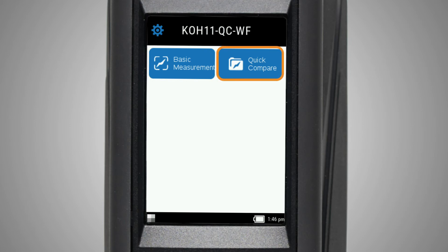To the right is quick compare. This mode is used to create standards or select standards from a library. Jobs can be viewed and downloaded from this mode as well. If any job templates are loaded on your device, they will be displayed in this area.